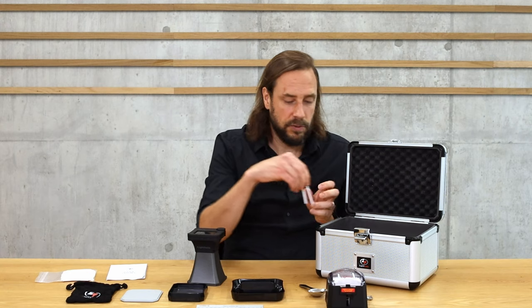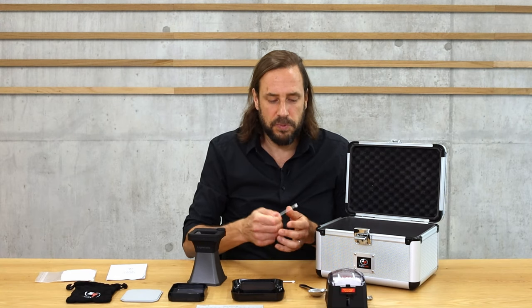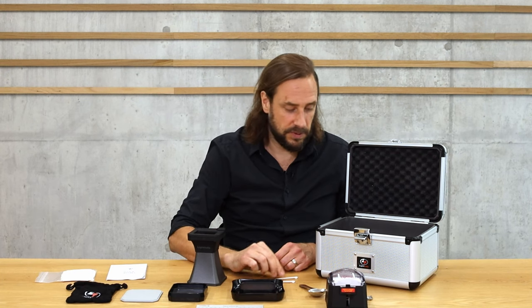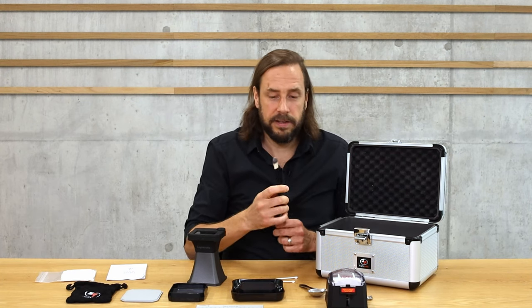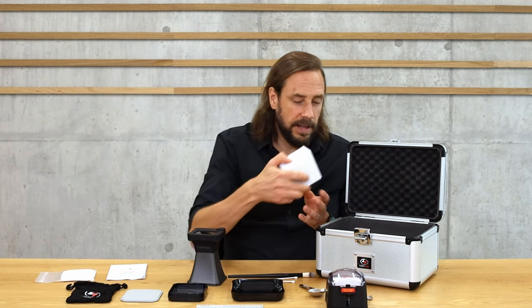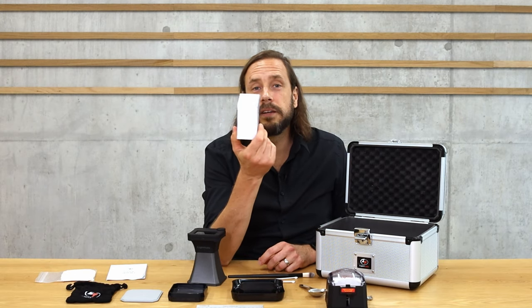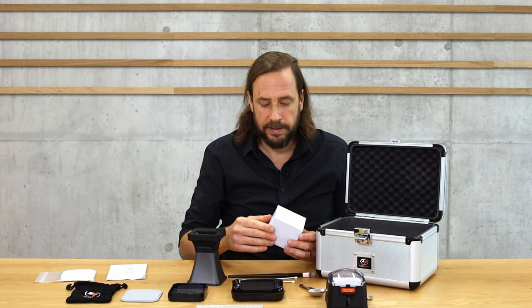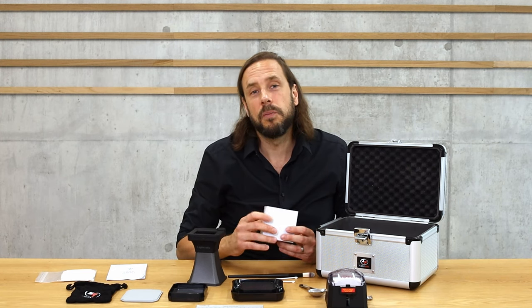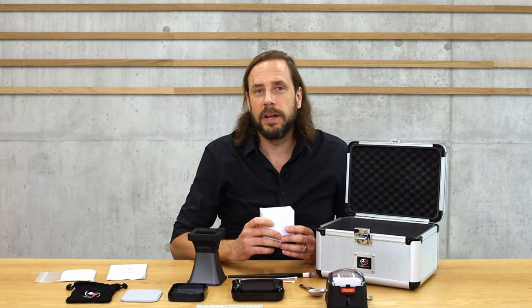You also get two spoons — one being a replacement spoon — used to prepare samples for particle size distribution, plus a brush to clean everything. In the box there is a charger — a two-pin charger usable anywhere in Europe — and a cable for both charging the device and connecting it to your computer via USB to transmit values and get them into an Excel file.